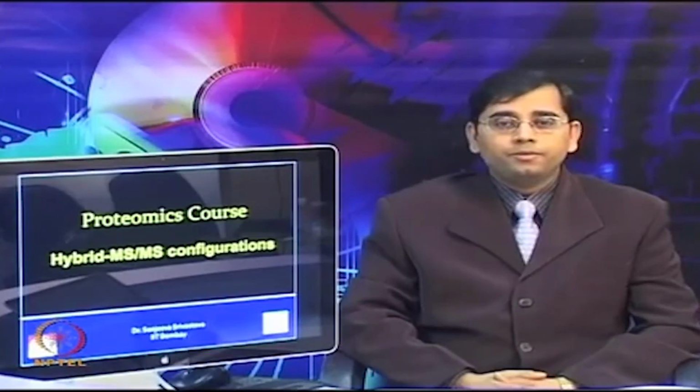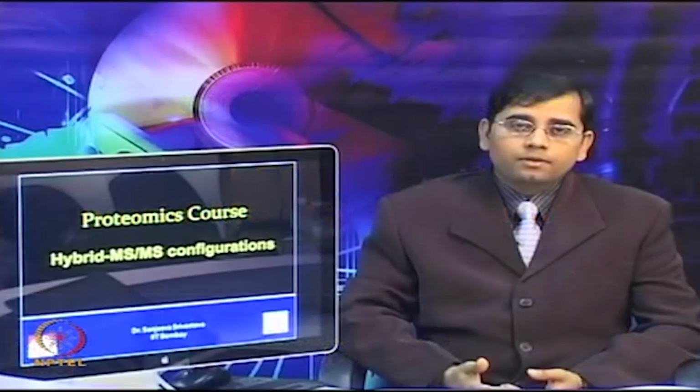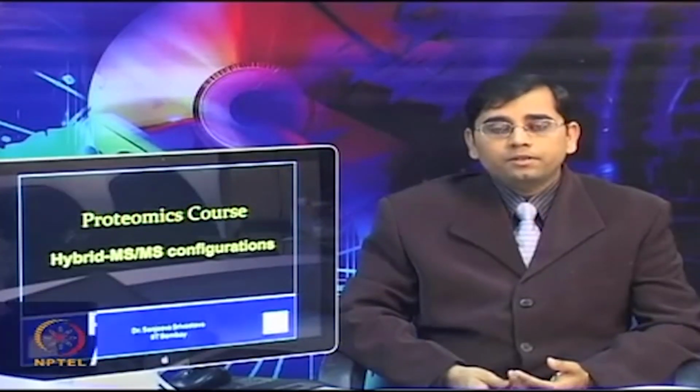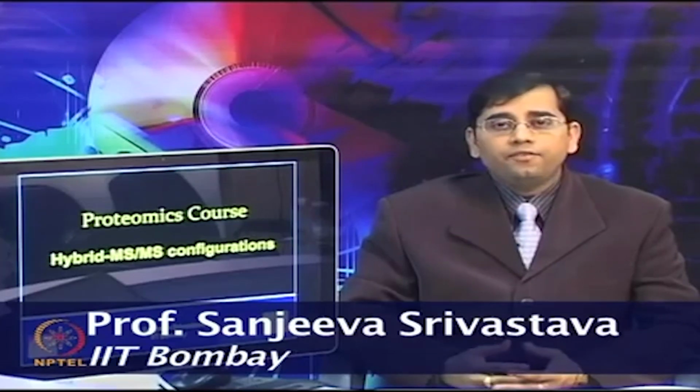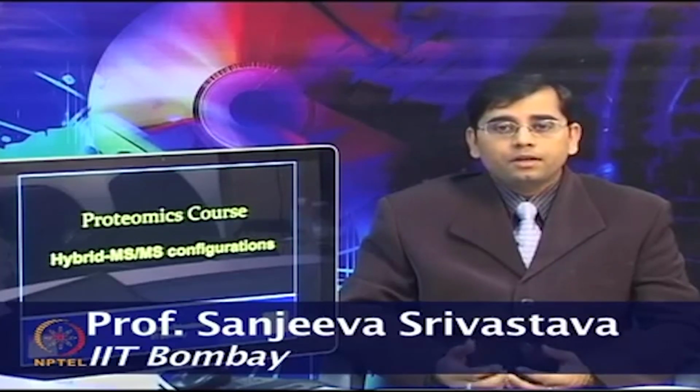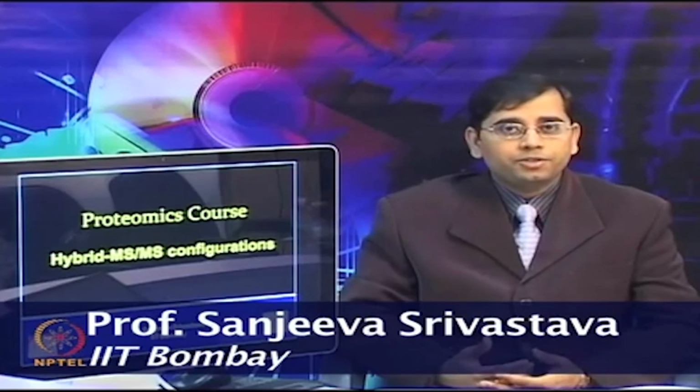Today we will talk about hybrid MS-MS configurations. As we have discussed, there are different types of mass spectrometers available, and depending upon the mass analyzers and how they can be used together, different types of MS-MS configurations, hybrid MS-MS, have emerged.